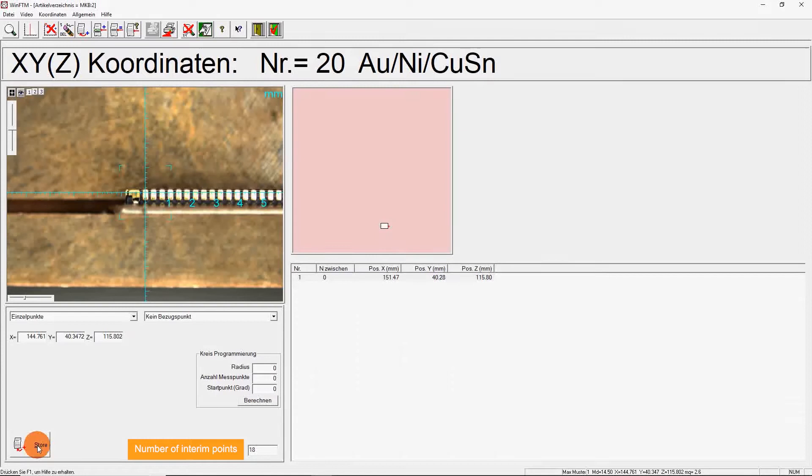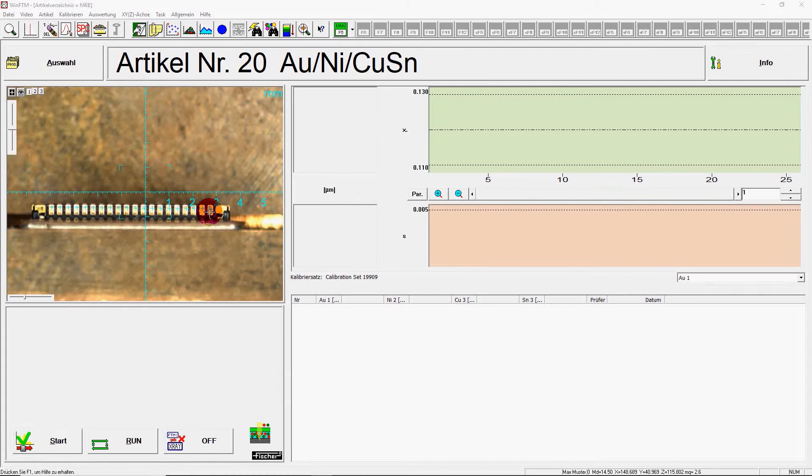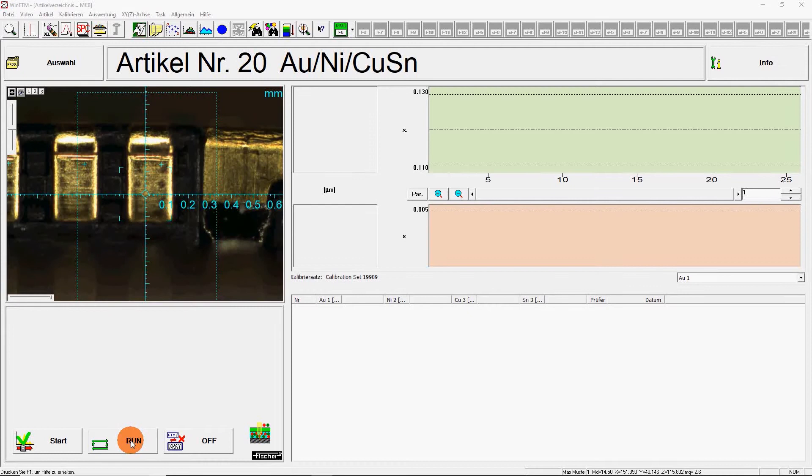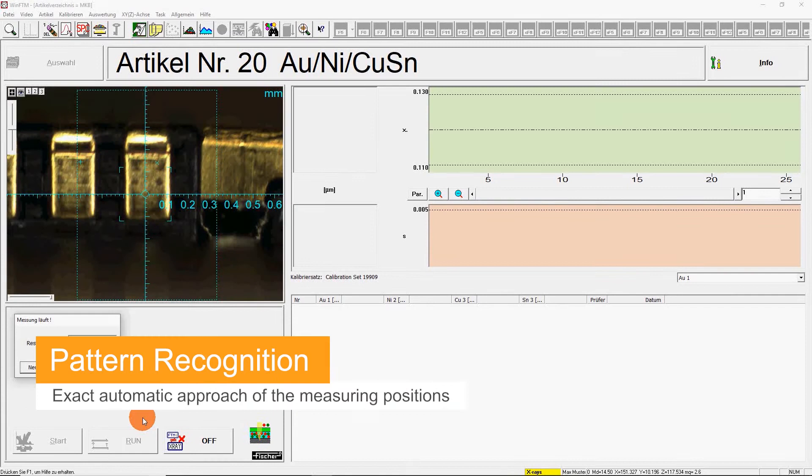The measurement is now performed automatically for all 20 measuring points. Thus, the XTV Mu moves to the exact measuring positions using the pattern recognition, eliminating the need for the operator to define each measuring position individually. That saves time and greatly simplifies the handling of the X-ray.